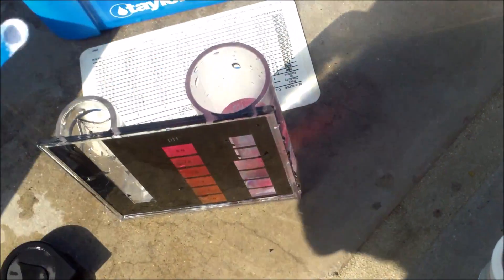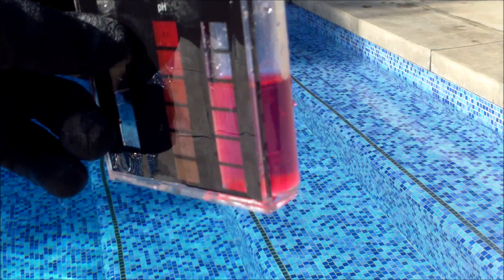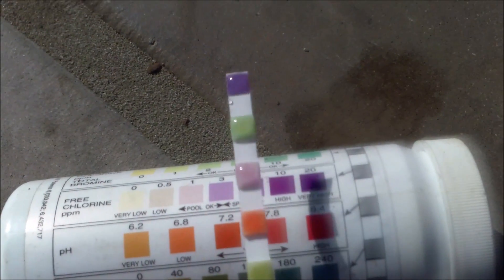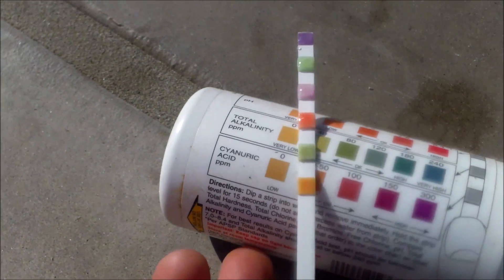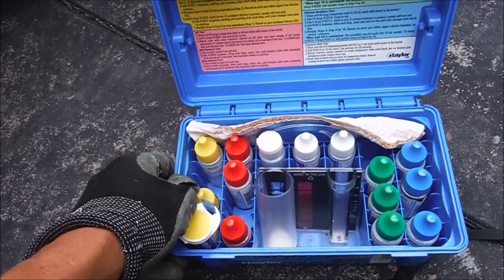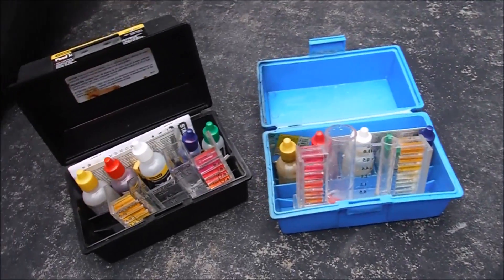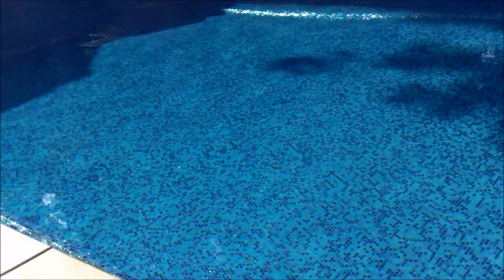You can see the K2006 is showing some free chlorine. The test strip is showing free chlorine of about 3.0, a pH of about 7.6, an alkalinity reading of about 80, and the cyanuric acid reading is showing it's about ideal at 30 to 50 parts per million. So the Taylor K2006 is probably the best test kit you can get. The K2005 and lower models are also good. The 5-in-1 OTO test kits are handy to use. Test strips are definitely not a standalone tester — you'll need a good test kit to go along with them to help maintain your pool and keep it looking sparkling blue.